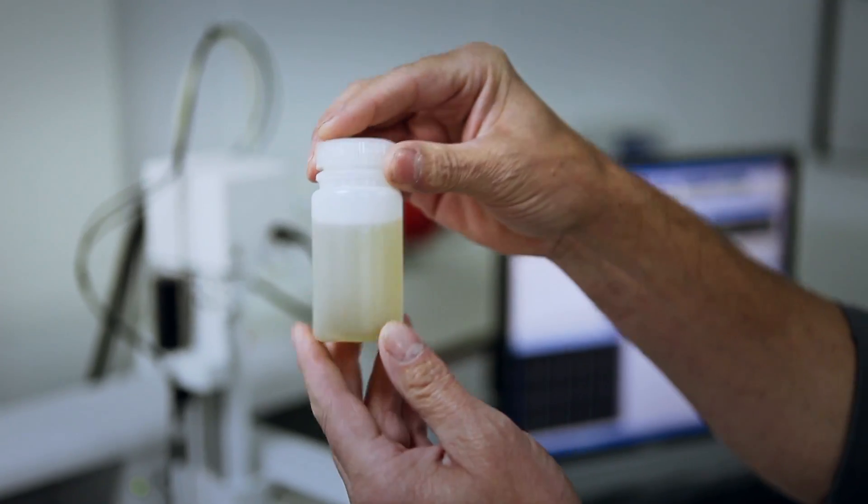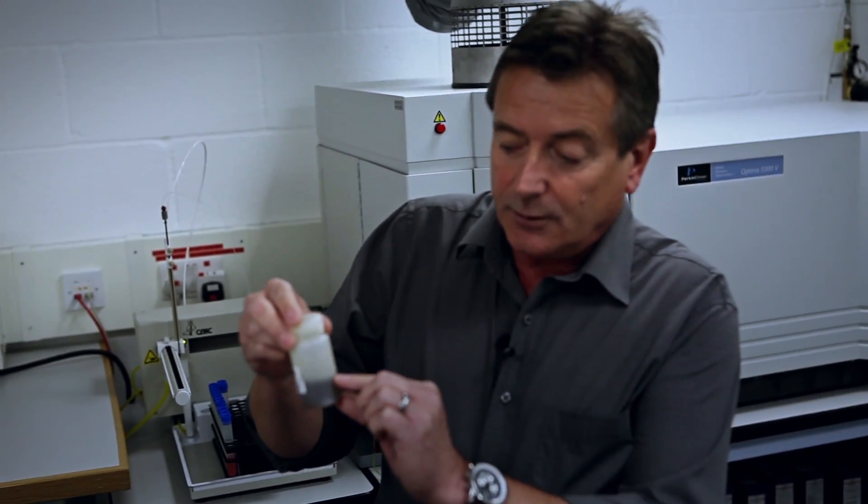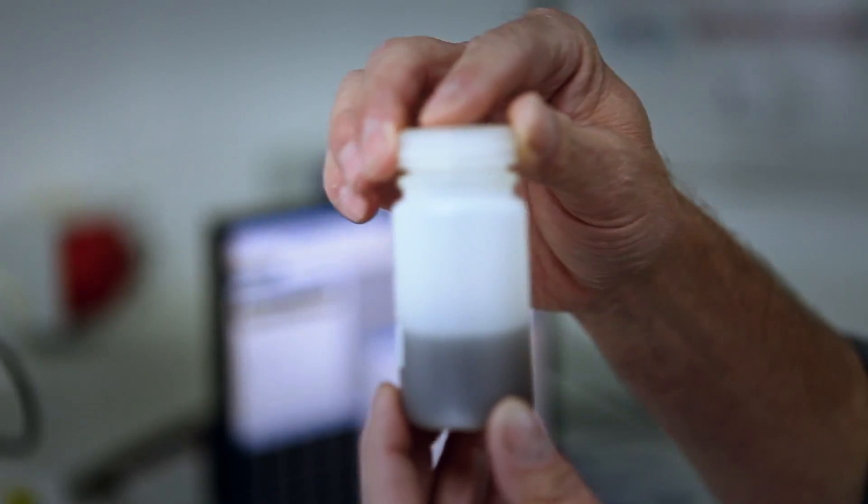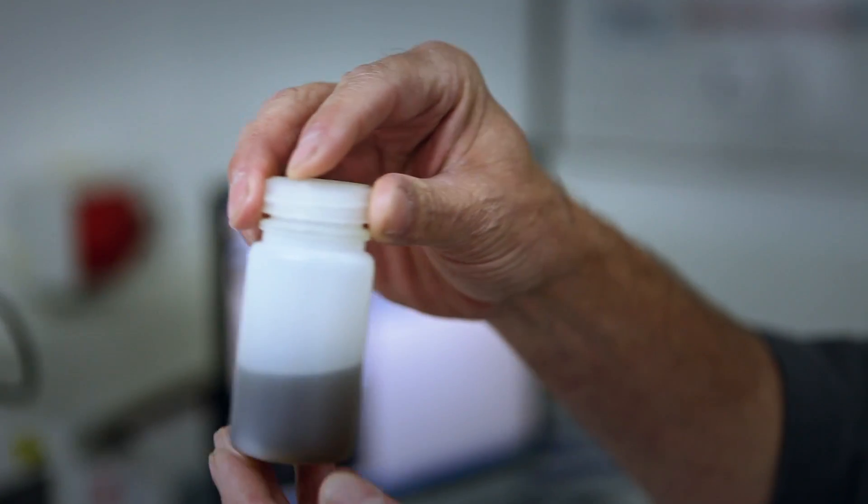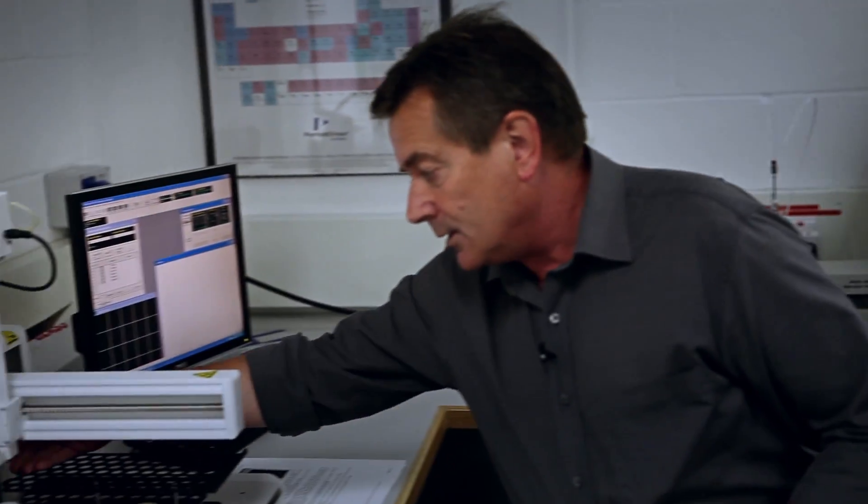We get an oil sample, put it on the machine, measure it. We can then get the oil that's done 100 kilometres, 200 kilometres, 300 kilometres. Place it on the machine. It's diluted, placed in a row of test tubes.